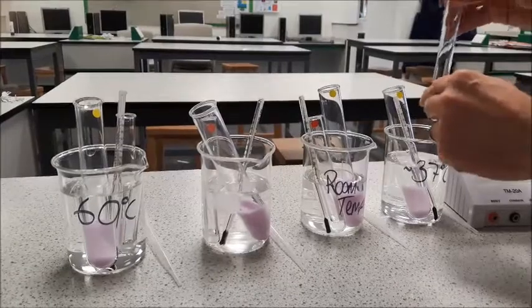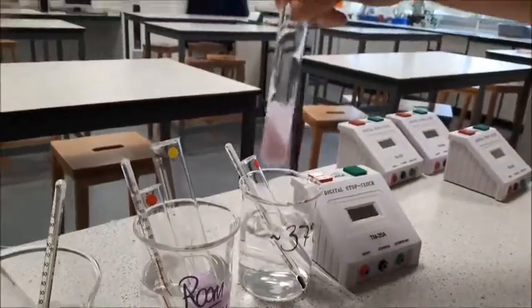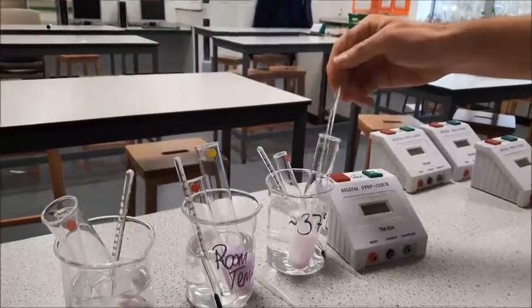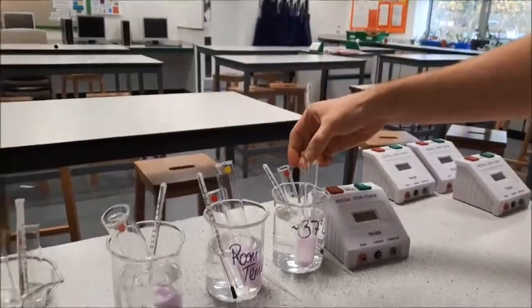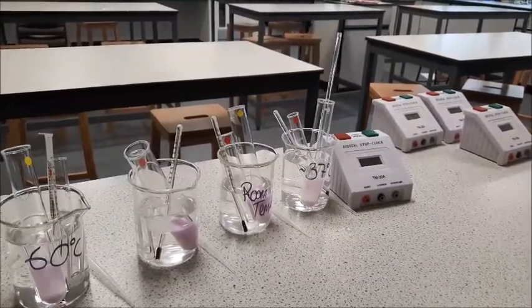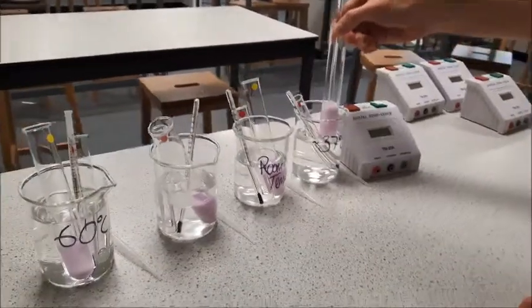I'm going to pour this into my milk boiling tube and press start on my timer. I'm going to give that a swirl around and we're going to time how long it takes to get a colour change. I'm also going to use a glass rod to make sure I've really mixed the lipase in well. As the enzyme works on the fat in the milk, it's going to convert the fat into glycerol and fatty acids, and that is going to change the pH — slowly making it more acidic — which will hopefully give us a colour change with our indicator.